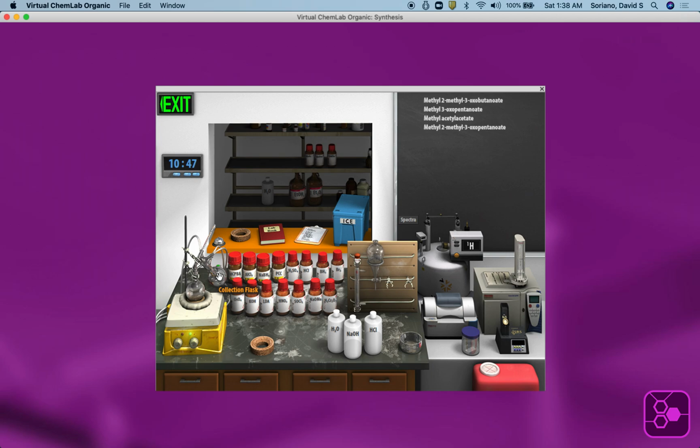Okay, what I'm going to do at this point is hold down L drag. I'm using a Mac. And there are the 4 products. And we can do, of course, a complex mixture. What we can do is maybe try an FTIR.